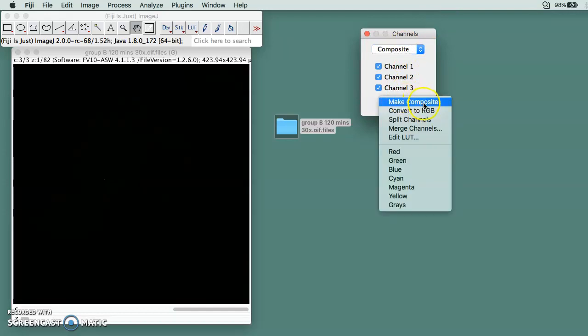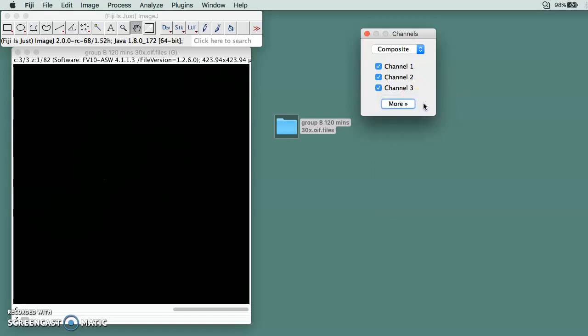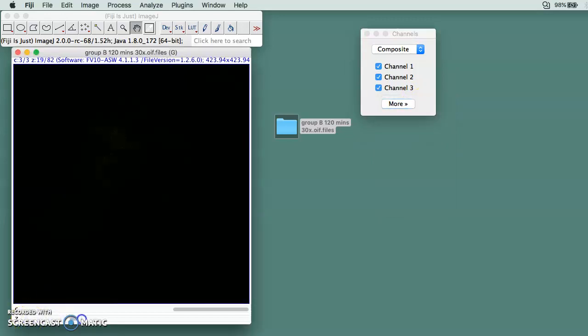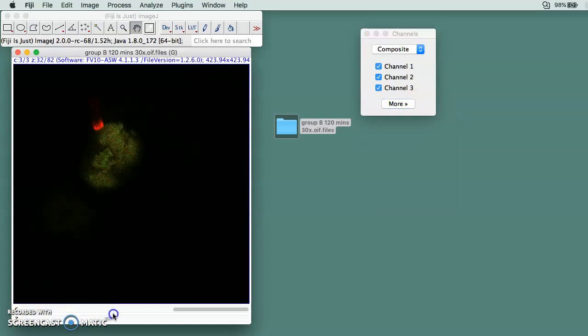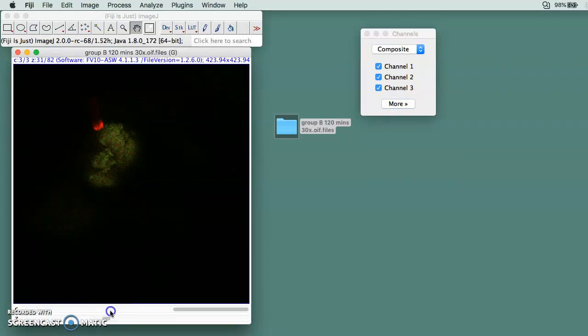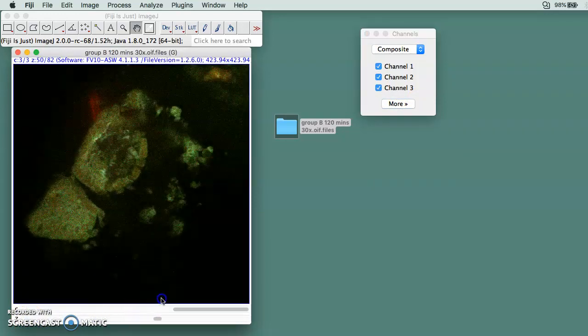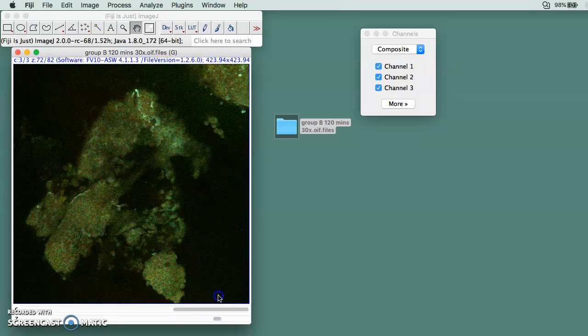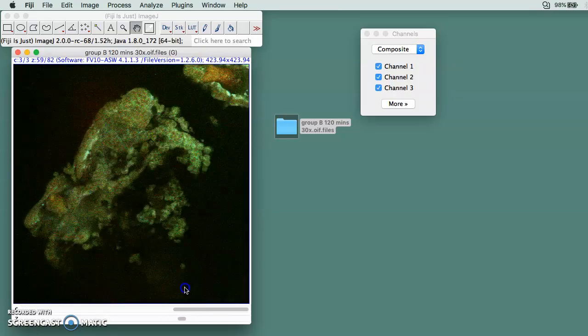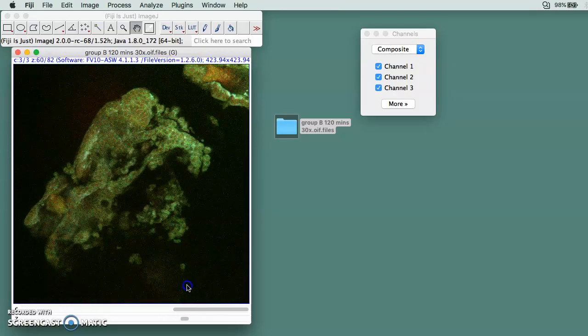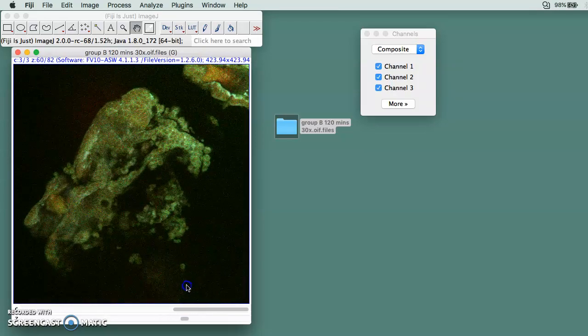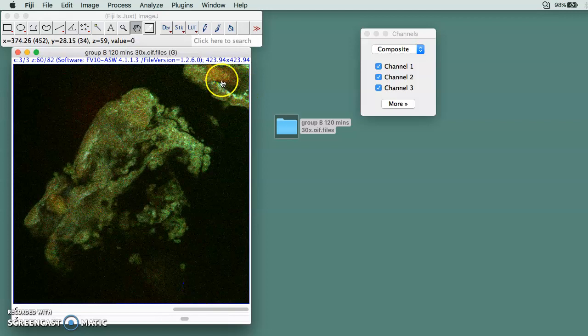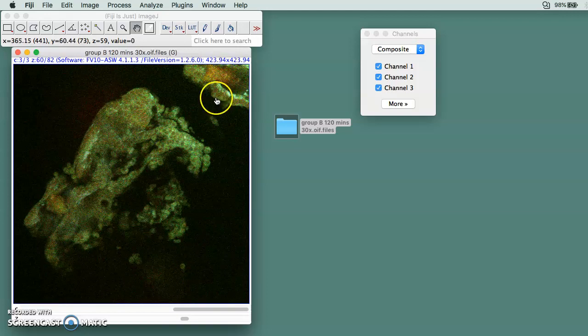After you finish all this, you go to Compose and then you click More, and then you do Make Composite. You should be able to get three colors. I have red, green—it's not very clear but you do see three different colors.